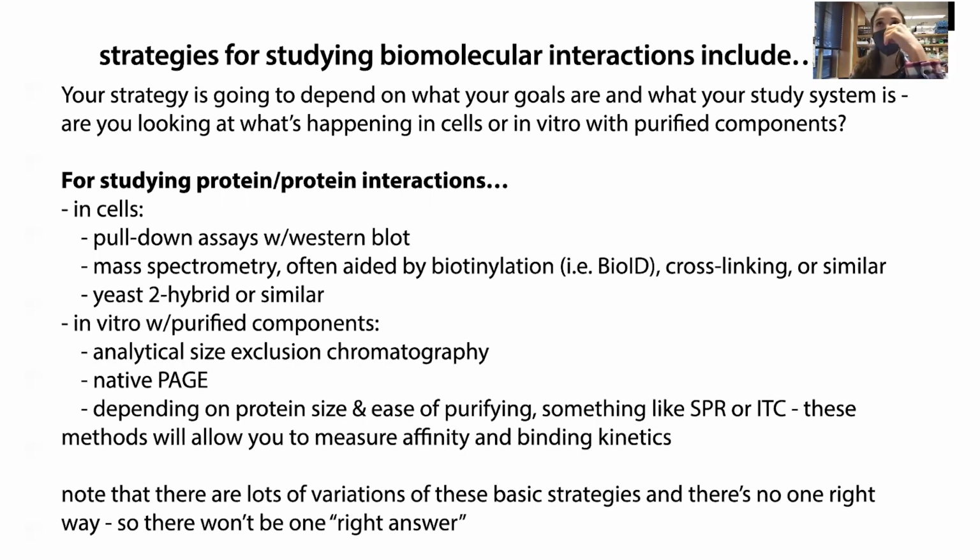So we have these different ways to study things, like I was saying, some of them are in cells and in vitro. And so we'll start with the in cell stuff. Unless you're testing your hypotheses after you do stuff, a lot of the work in cells is often more exploratory. So maybe you have an idea and you want to test it. You have an idea it might interact with this sort of thing, but a lot of times you don't really know what it's interacting with, and so you want to find out. There are different ways to do this sort of thing.